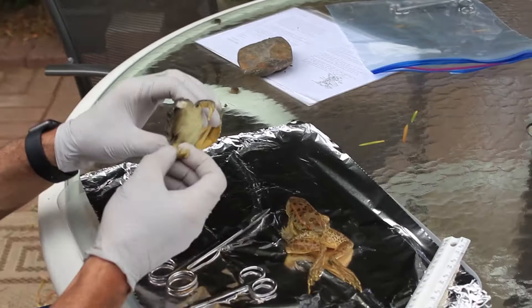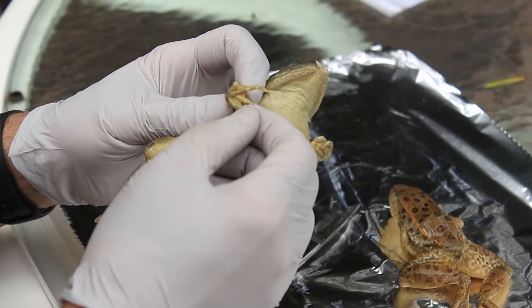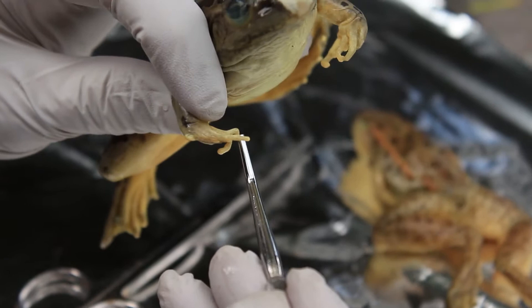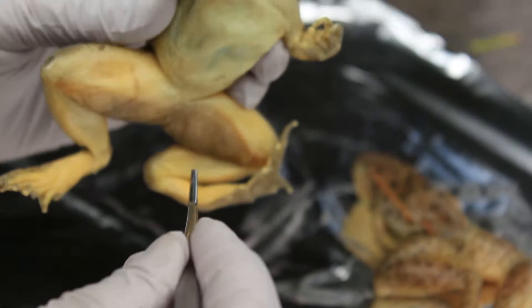Let's look at some external anatomy of the frog. First of all, if you look at the frog closely, its front paws or hands have four fingers — one, two, three, four. They also have fingernails here. If you look closely, you can see the fingernails. Ladies, if you were wanting to do their nails or something like that, you'll probably have to hold off on that.